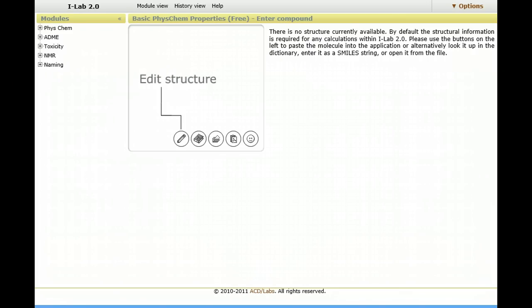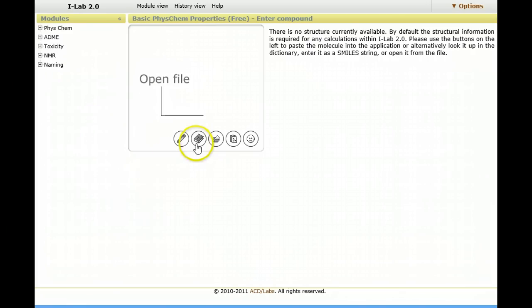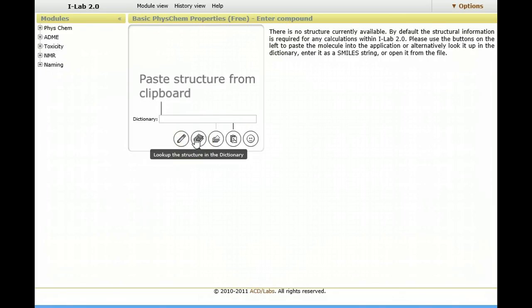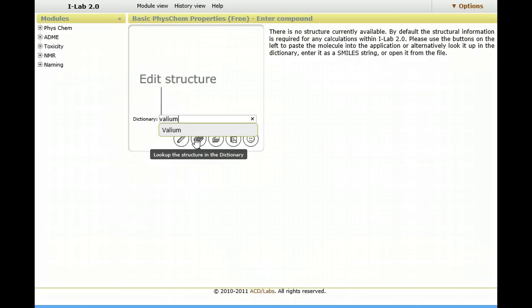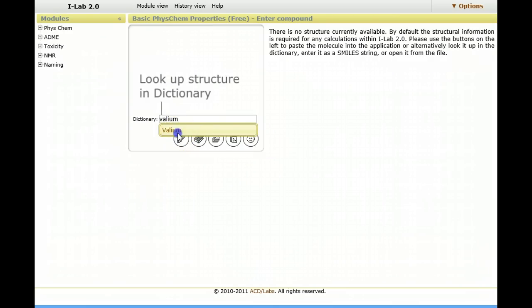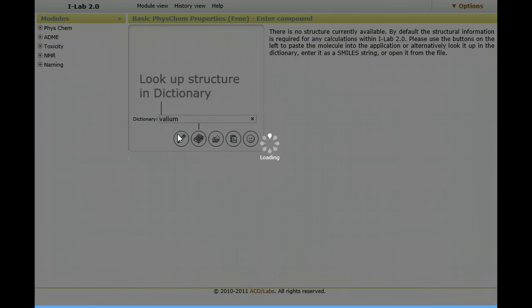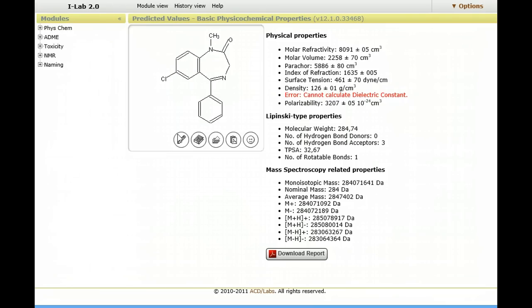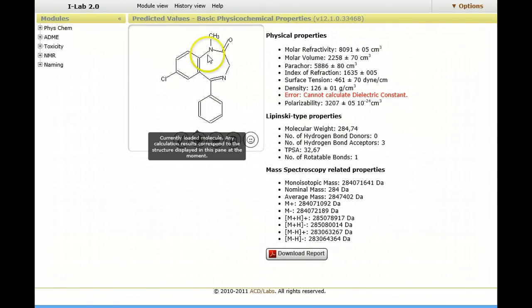As an example, rather than draw a valium, I'm going to look it up in the ACD Labs Dictionary. So I type in the name, it tells me it exists, it's retrieving it from the dictionary, this is the chemical structure.